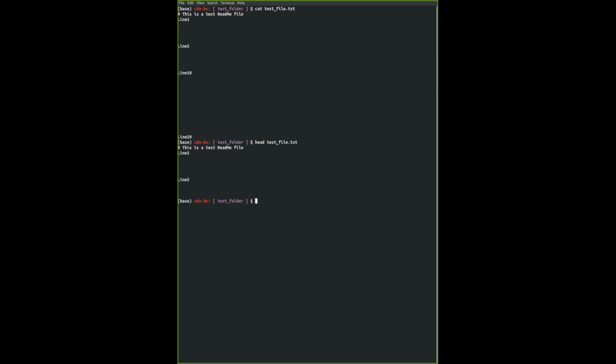Okay, you can change the number of lines to print. So I'm going to press up and then move my cursor back somewhere here, and I'm going to type -n and then 4. Basically that tells it the number of lines to print is 4, and you can control the amount of information to print out.